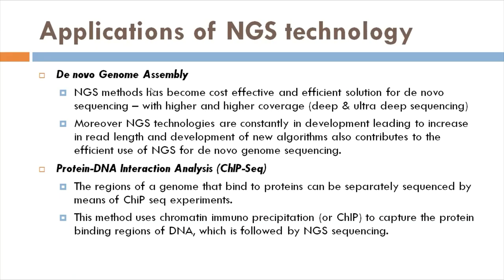But you have to understand that since a reference genome is not available, you need to have very high quality data to do this de novo genome sequencing assembly. And ChIP-seq methodology is also a very interesting application of NGS.